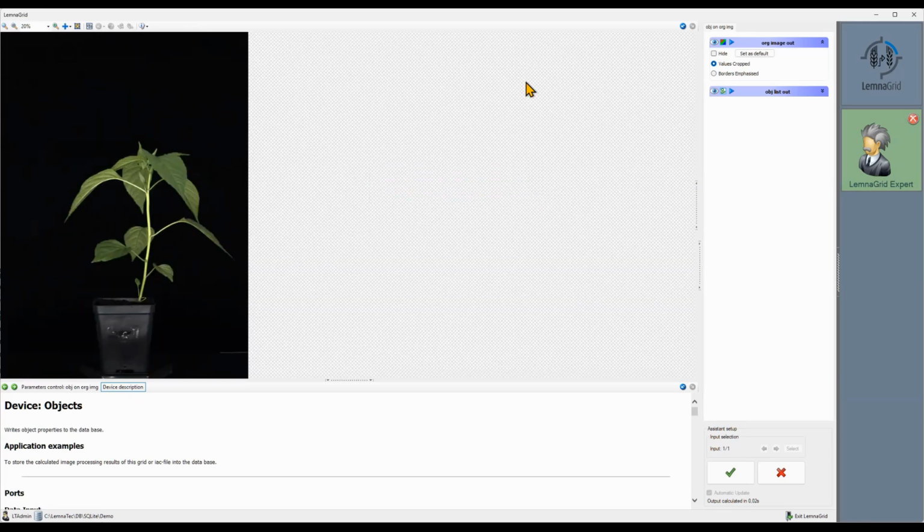You remember the folded section at the side of the images I mentioned in the last video? This becomes important now. This image has two layers, each of which has a control section here. The section opens if we click on it. Right now we want to work with the object list out section.